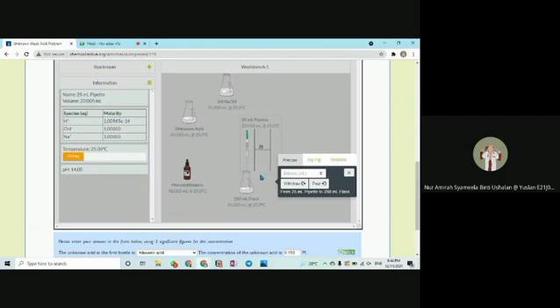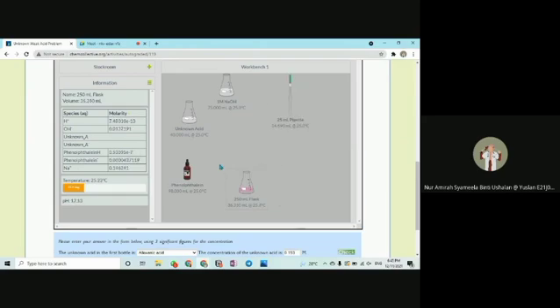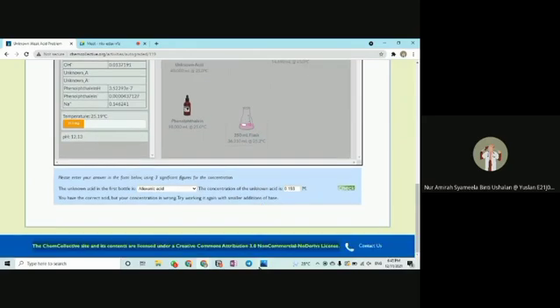Earlier, we managed to know the concentration vaguely, which is 6, but now we're going to try to do it slowly, starting with 4, and then we're going to go with 0.1 at the beginning. We're going to continue this until it turns pink, which is the reaction, neutralization. So, I'm just going to continue showing the calculation instead.